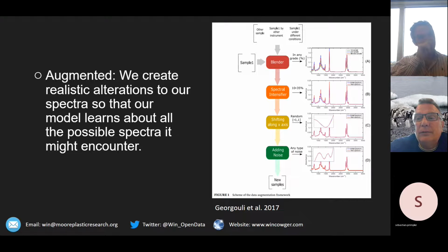I mean, just even putting on the glass filter top. Do you use PP supported ones? Yeah, we obviously use PP supported ones, because the other ones don't work at all. I agree, that's our experience. They are not suitable at all. That's why we decided to use PP supported ones, and they are well handleable. But then you just need to take care that you don't crush the PP as well.